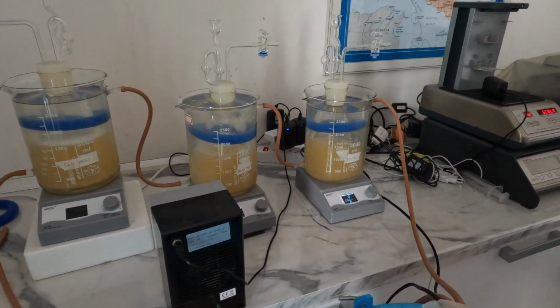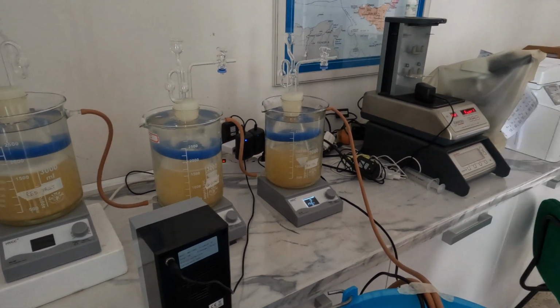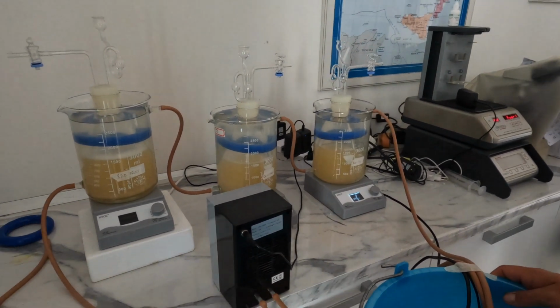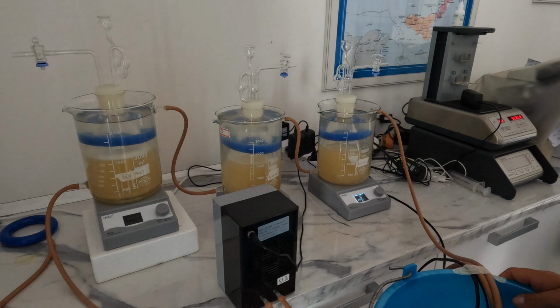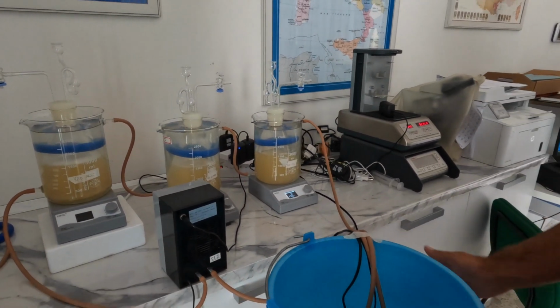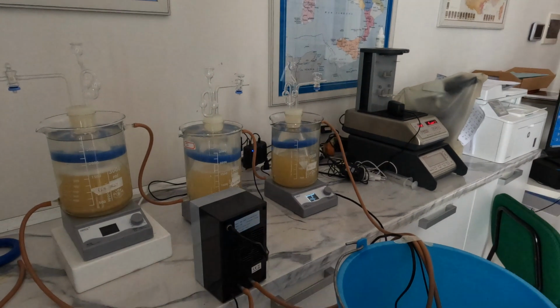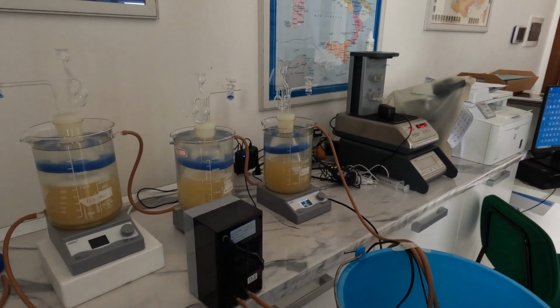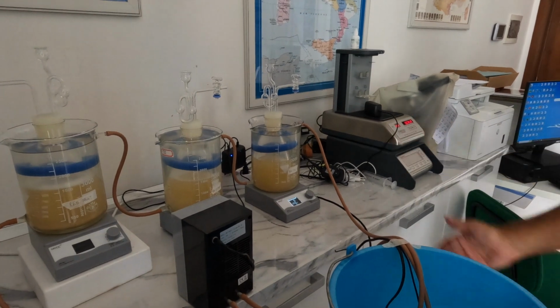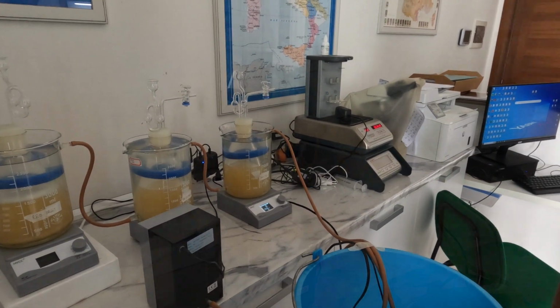Now every day I evaluate the process of fermentation. So at the end I evaluate which is the greatest yeast to use for this typology of must.